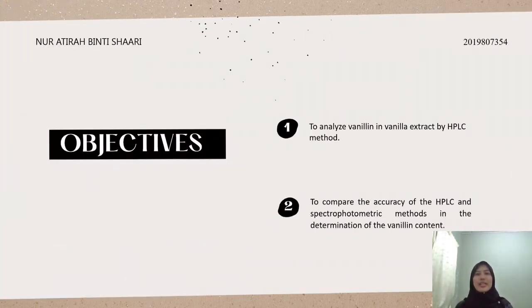There are two objectives in this experiment. First, to analyze vanillin in vanilla extract by the HPLC method, and second, to compare the accuracy of the HPLC and spectrophotometric methods in the determination of the vanillin content.